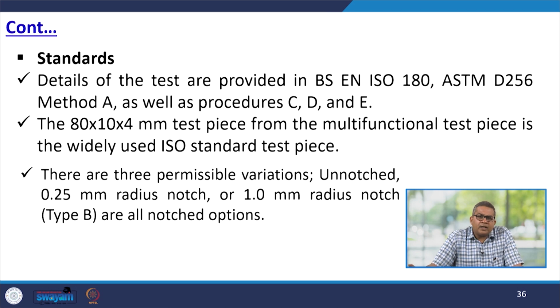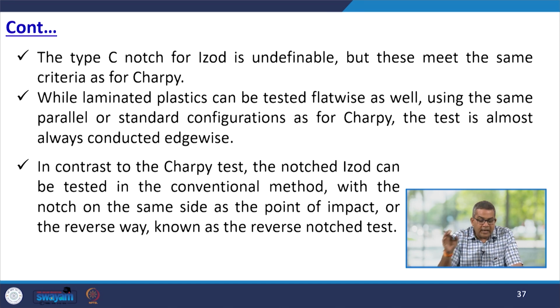They are all notched options. The type C notch for Izod is undefinable, but these meet the same criteria as for Charpy. While laminated plastics can be tested flatwise as well, using the same parallel or standard configuration as for Charpy, the test is almost always conducted edgewise. In contrast to the Charpy test, the notched Izod can be tested in the conventional method with the notch on the same side as the point of impact, or the reverse way known as the reverse notch test.